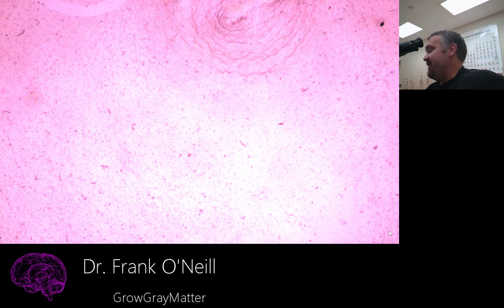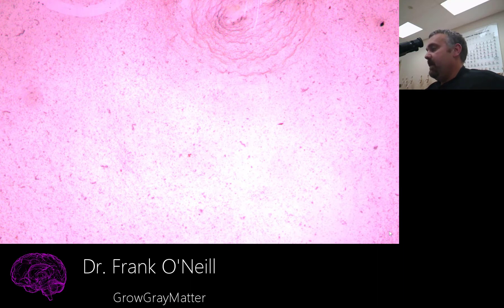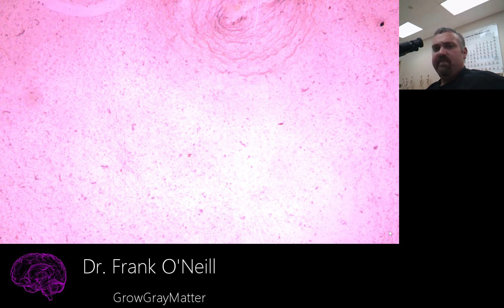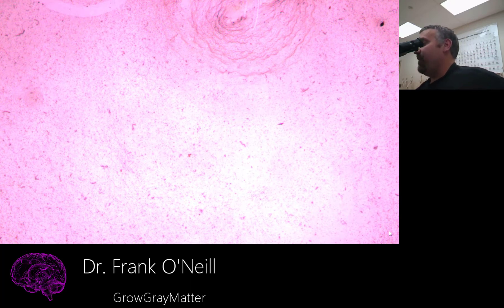If you can get good at not only seeing bacteria but seeing their tails, then you know how to use a microscope. That's why I wanted to choose this organism. In other videos I may talk about what Proteus vulgaris does and the fact that it causes nosocomial, or hospital-acquired, infections — but that's beyond the scope of today's video.